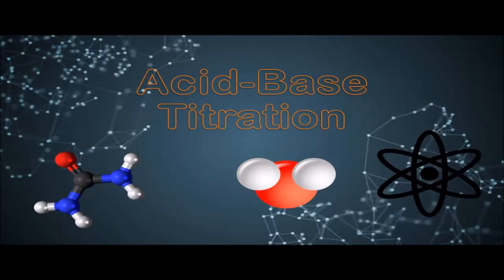Acid-base titration. Today we are going to do the lab of acid-base titration. First, we should know what acid-base titration is. An acid-base titration is a process used in quantitative chemical analysis to determine the concentration of an unknown acid or base. Acid and base react with each other to form salt and water.